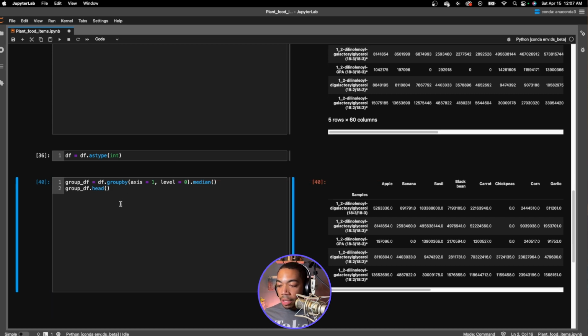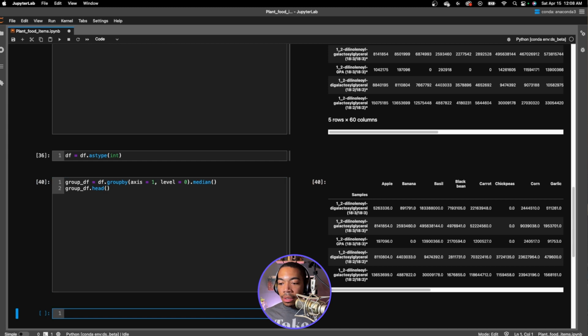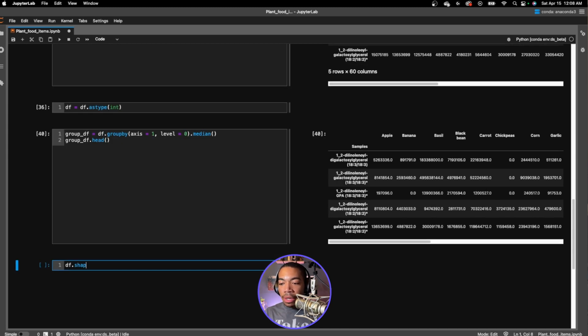Instead of building a recommender based on all these variables individually, this data is a really wide data set. If we look at df.shape, we have basically one sample per each variable, kind of a 1-to-1 ratio. The statistics are kind of against us in this case, this curse of dimensionality. So let's reduce the dimensionality and give ourselves a better chance at building a suitable recommender.